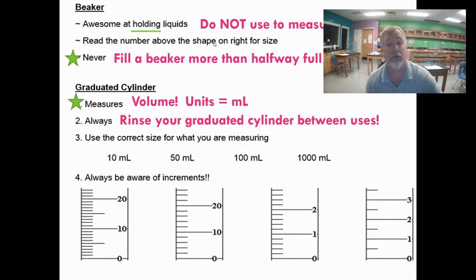Always rinse your graduated cylinder between uses. This is very important. If you put a chemical in it, measure it out, put it into your beaker or whatever else we're using for a reaction, and you come and put a second chemical in here, guess what? You just contaminated what you're putting into your graduated cylinder that second time. We don't want them to mix together. Sometimes it just mixes them together, and it makes it dirty. Other times it might start a reaction in your graduated cylinder. Not a good thing. All right, so always rinse your graduated cylinder between uses.